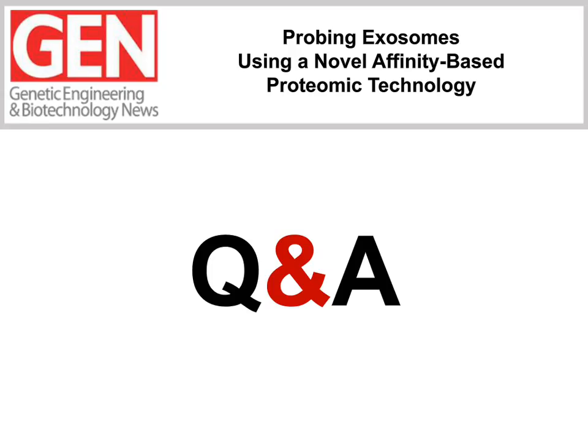Which is the best in terms of plasma or serum? I think the general consensus for exosomes is that plasma is better. The idea is that when you form a clot, you lose a lot of your vesicles as part of the clotting process. Some people have estimated this loss to be as much as 70% of the exosomes being down in the clot. So if you're really up against it in terms of getting quantity, I think plasma is ideal.